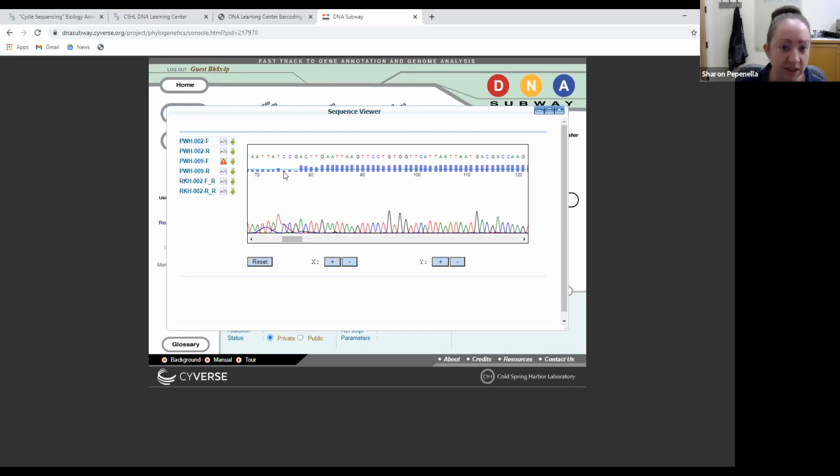So you can see here these lower peaks, these are probably 10s. Why are those considered 10s? Well, if we actually look at the electropherogram data, you can see there are overlapping peaks here. So that's low quality. A lot of times these overlapping peaks will have lower scores, whereas the nice clean peaks here are all given a score of 50. Okay, so that's very important.